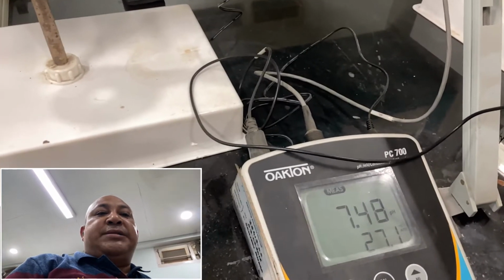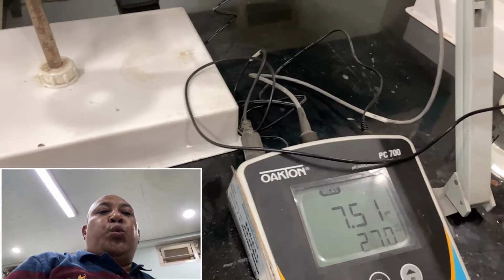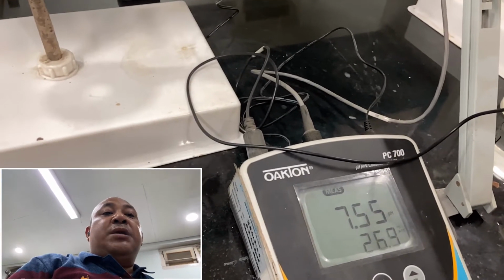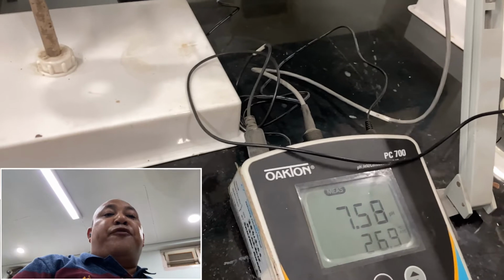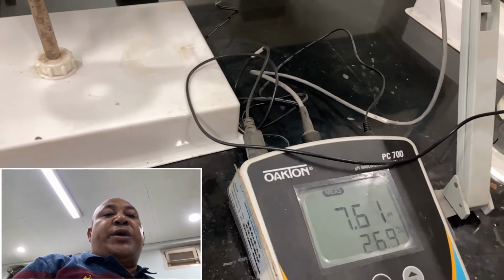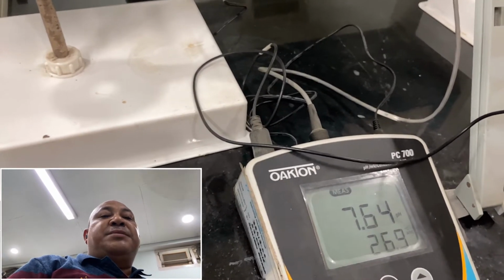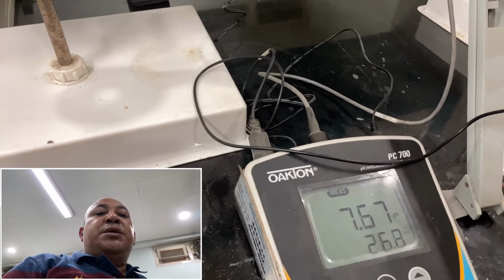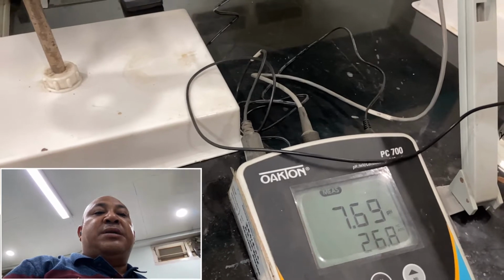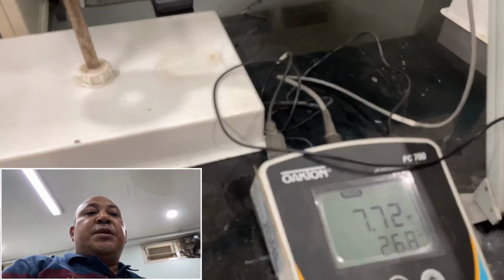Another interesting fact is that if it's a very good, expensive, very sensitive pH meter, the fluctuation will be very high because of its sensitivity. For a low-cost one, a lot of error will be there. 7.4, 7.6 will be considered as a single unit. So let's wait for the ready symbol to come. Sometimes the temperature also plays a role. We have a ceiling fan, and due to the movement of the ceiling fan, sometimes the pH also fluctuates because the temperature is fluctuating.